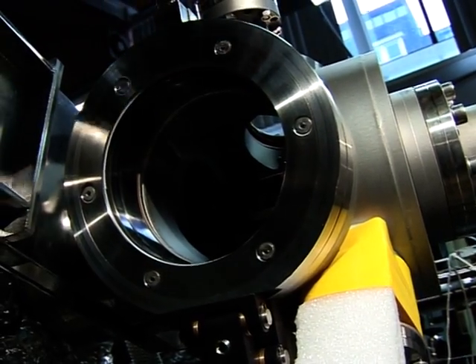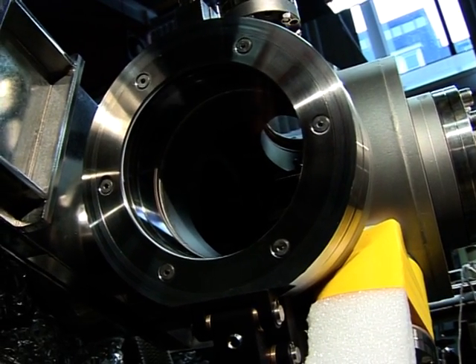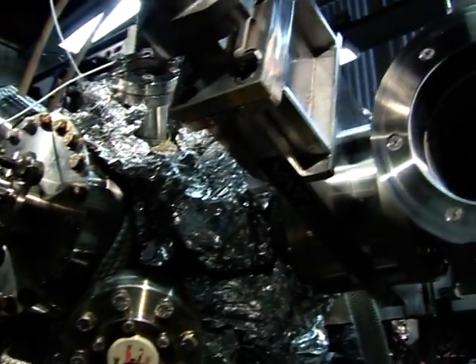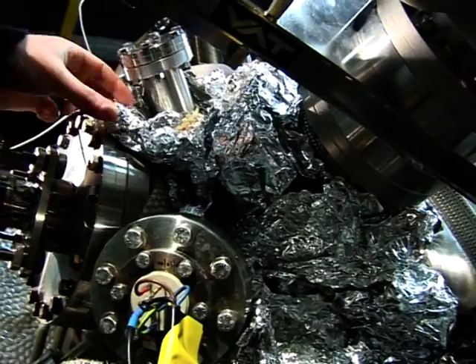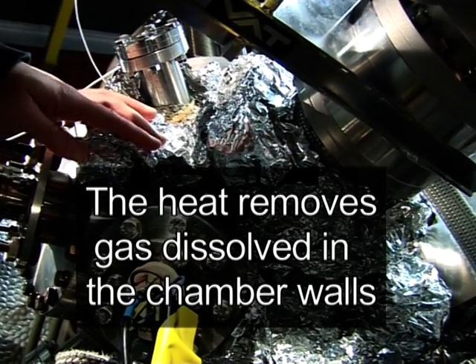So then we pump this chamber until 10 to the minus 7 Torr. And then we are able to transfer to the main chamber, which is this one. In order to have an ultra vacuum, we have to heat the chamber to 150 degrees. And we put the silver pepper on top of it to have a uniform temperature over all the chamber.